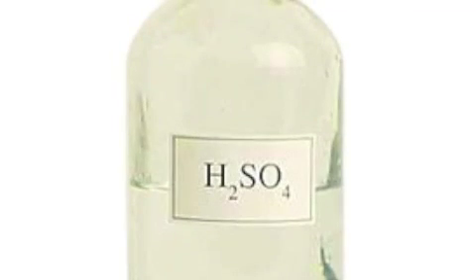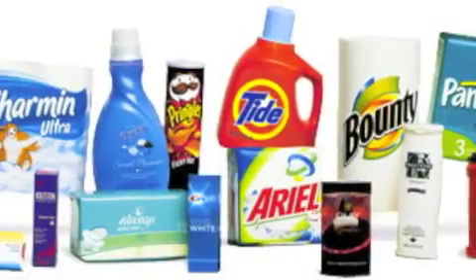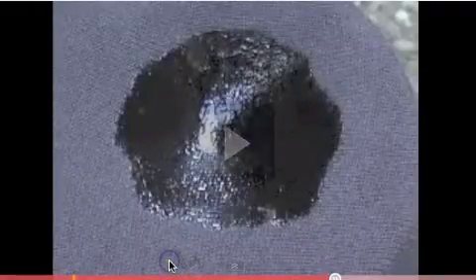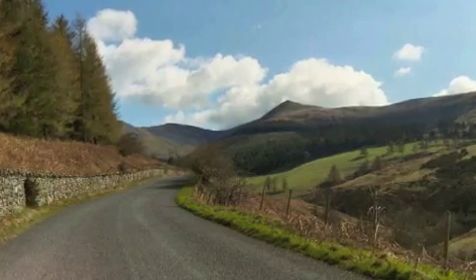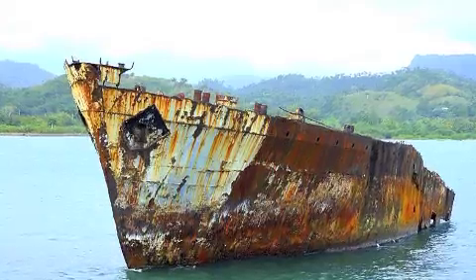We used H2SO4, sulfuric acid, because it is a very common acid that is used in almost 99% of all household products. So why would we still use this acid? The reason we chose this was because due to surface runoff, these acids usually wind up in lakes or even on the roads, so it will be in direct contact with the cars, boats, or machinery operating.